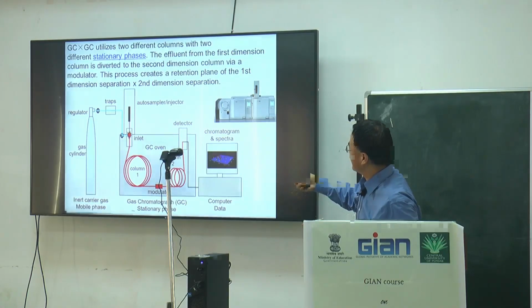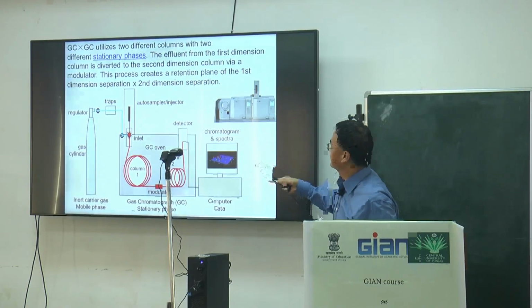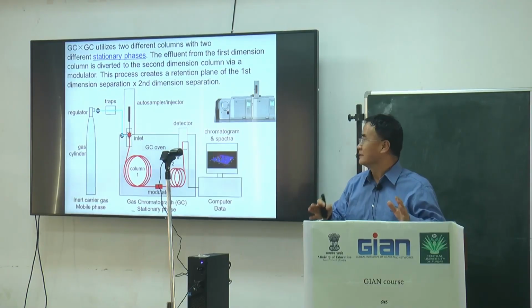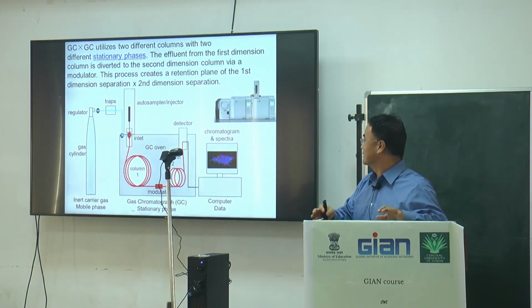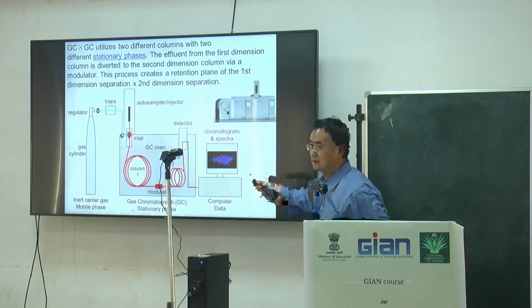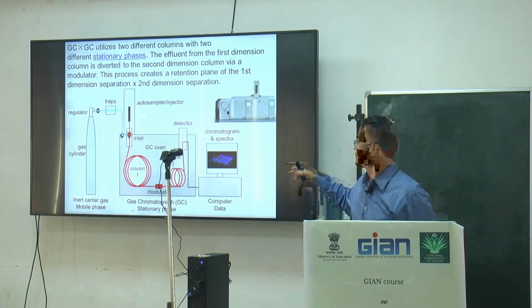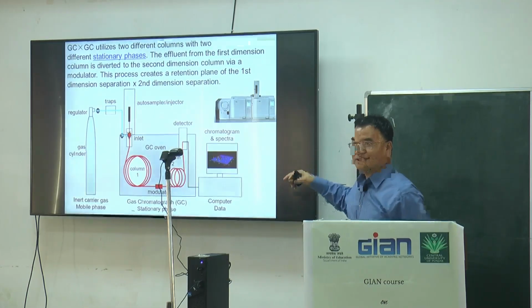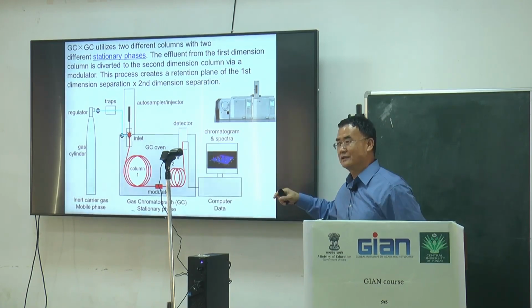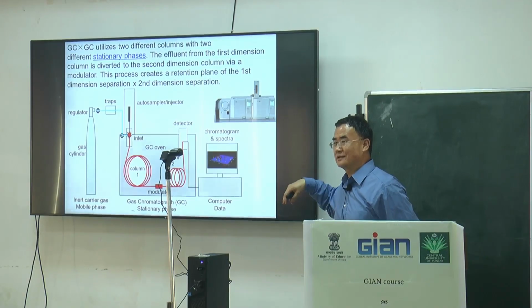Then there is GCMS, double GCMS, and 2D GC or LC, which achieve much better separation first, and later on the MS determines the mass and improves the identification because they have a library, right?